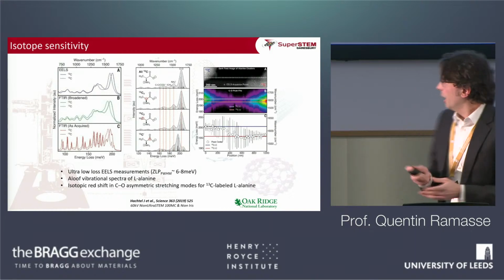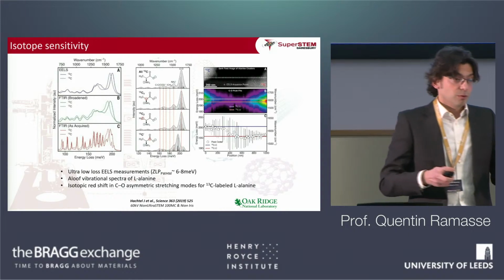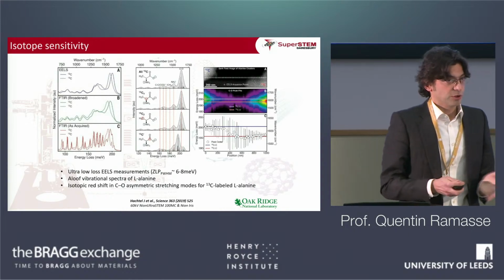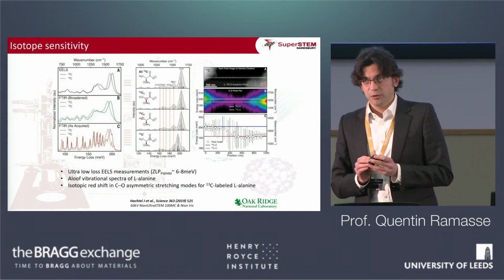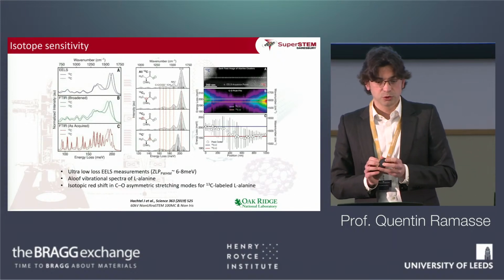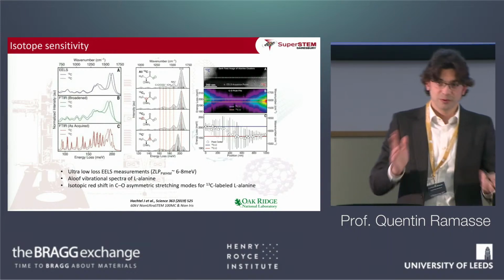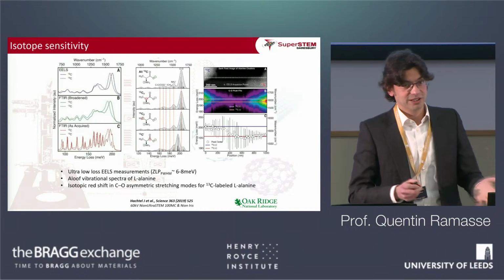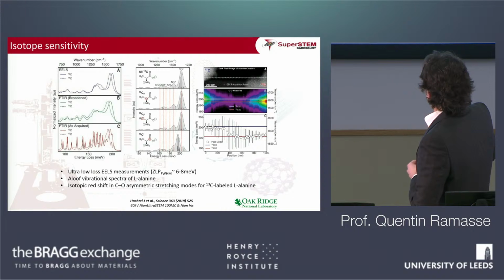You can. You can actually go towards isotope sensitivity. So we're not inventing anything. Electron microscopy is definitely not the only game in town. All the IR and Raman spectroscopists that I've talked to, when I said, oh, we can actually look at isotopes, I said, yes, so what? We've done that for a long, long time. What's exciting is you can do this somewhat locally on the nanometer scale.